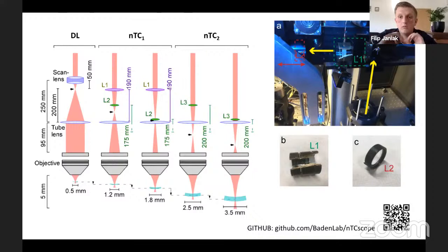All of the details are precisely described in the manual, which is available on our GitHub. We are doing our modification on the Sutter MOM microscope, which is relatively popular, but it's of course very easy to apply to any other microscope.